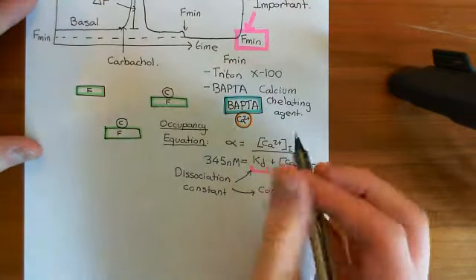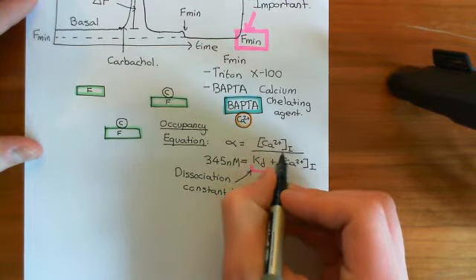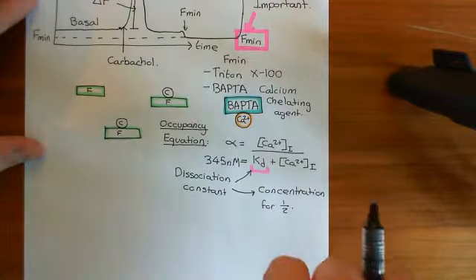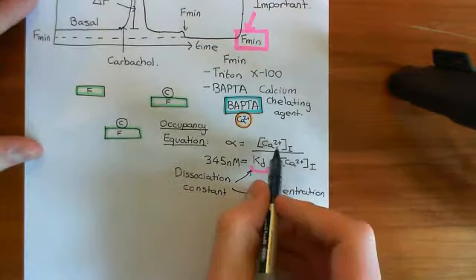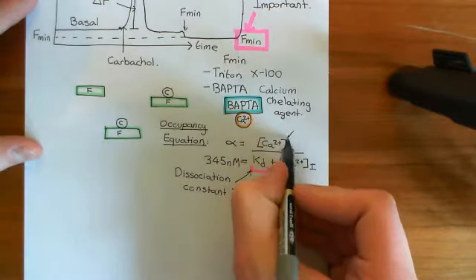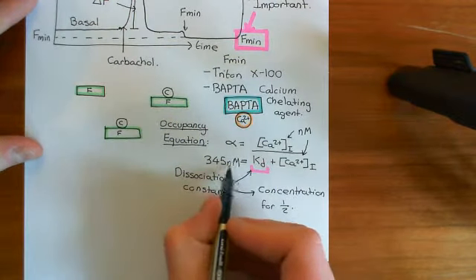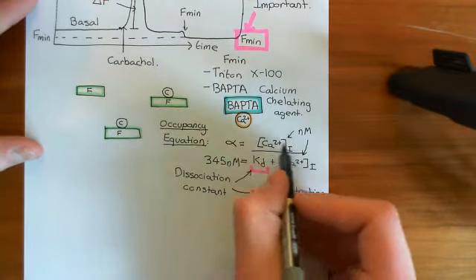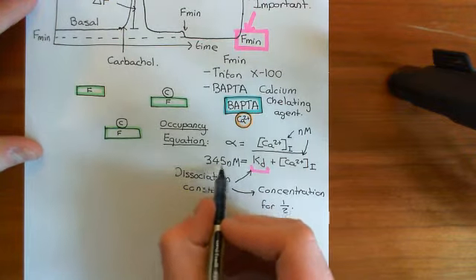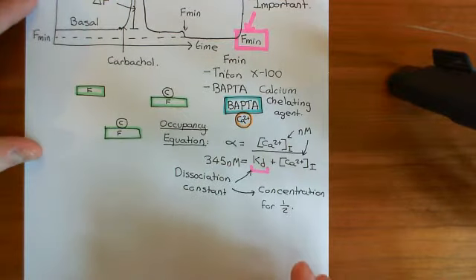What do I mean by that? I mean that if you're going to put in a calcium concentration in nanomolar, which would be a good idea because those are the sort of levels of calcium you're going to have in the cytoplasm of cells physiologically, then the dissociation constant also needs to be in nanomolar. If you're going to, for some reason, put these in molar concentrations, then you'd want your Kd in molar as well, so you'd have to multiply this number by 10 to the negative 9 to get it in molar. Okay, right.